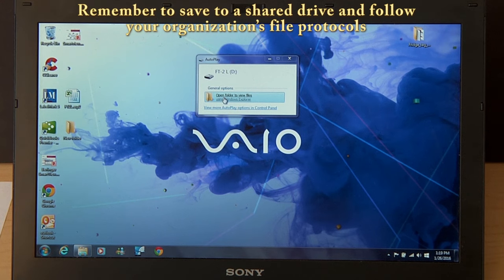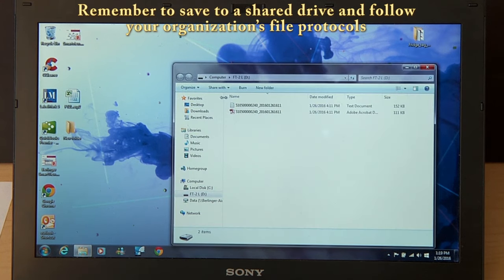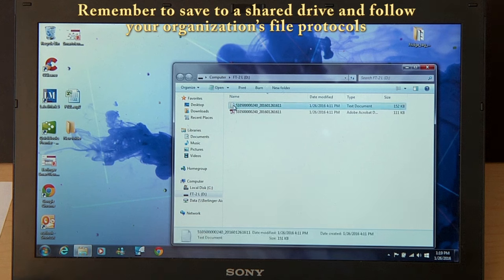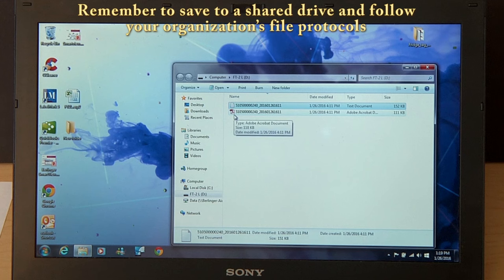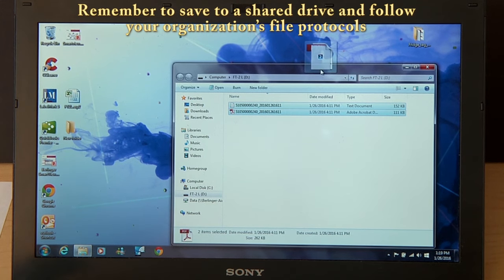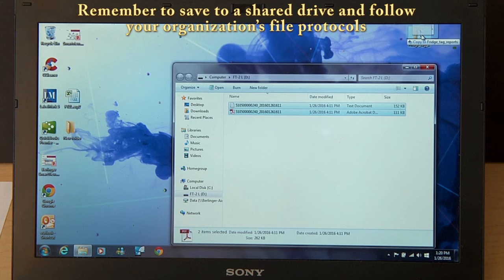Now, by double-clicking the open folder, you find your reports. It is a good practice to file the reports, so I suggest a left-click on the first one, hold the shift bar down, and left-click again. Then drag the two reports to your folder.